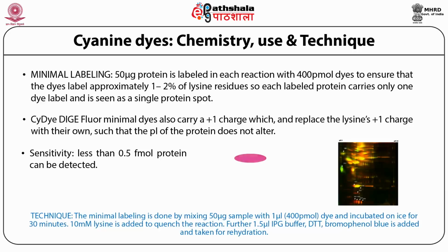The dyes are all charge matched and molecular mass matched to prevent alteration of the isoelectric point and to minimize the interference of the dye either to the isoelectric focusing technique or the SDS PAGE electrophoresis. The technique itself has an advantage of detecting proteins in the femtomolar range.